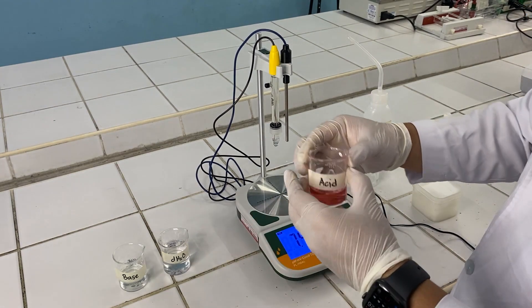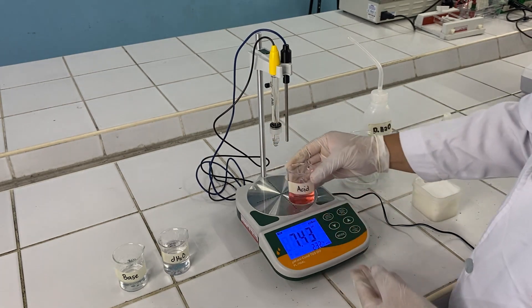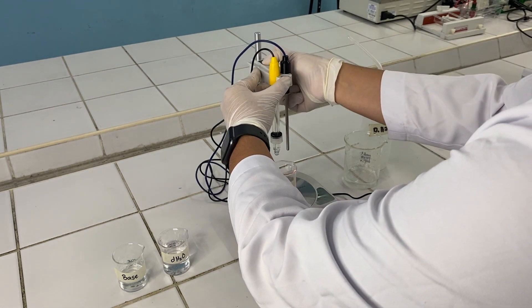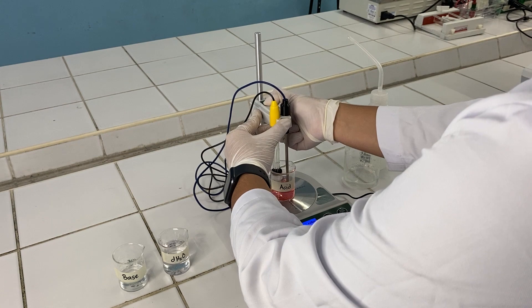After washing, you can then proceed with your next solution. This time, we are reading the acidic solution. The same as earlier, descend the electrode, allowing the bulb to be submerged under the solution.